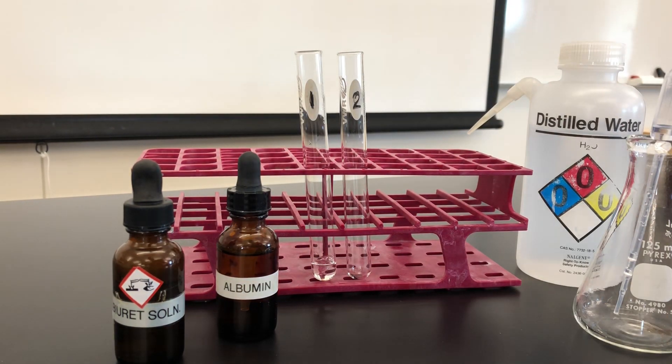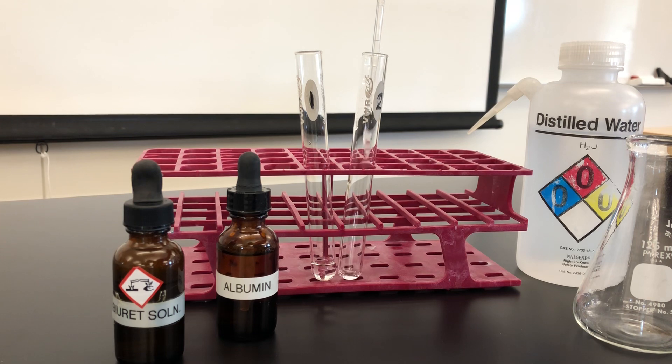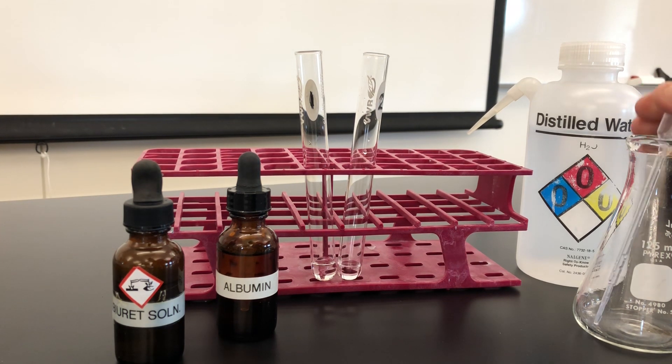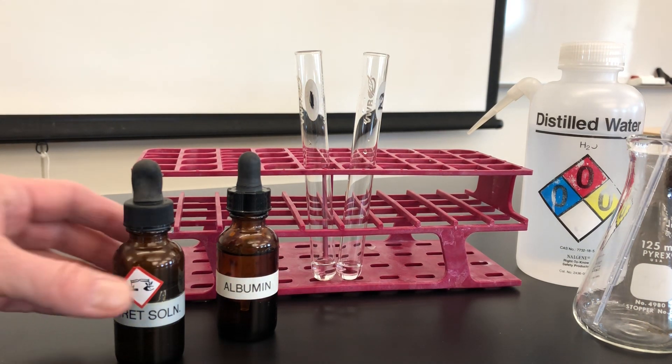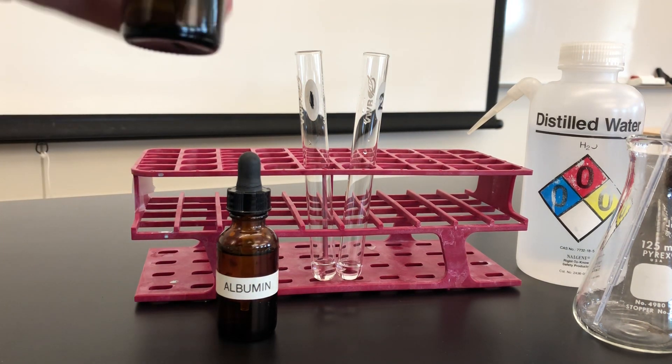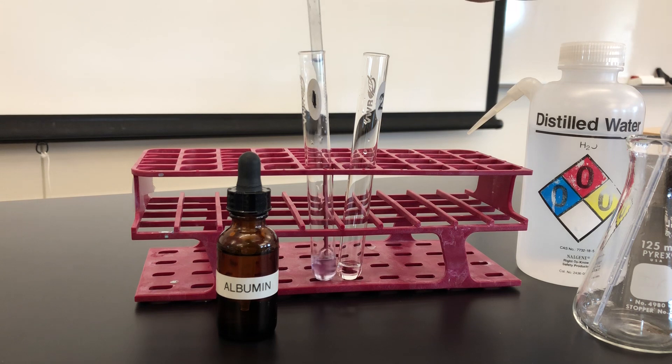To test tube number two I'm going to add an equal amount of distilled water. Both test tubes should be clear, and next we'll add the Biuret. According to the lab manual we add one dropper full. Note any color changes that may occur.